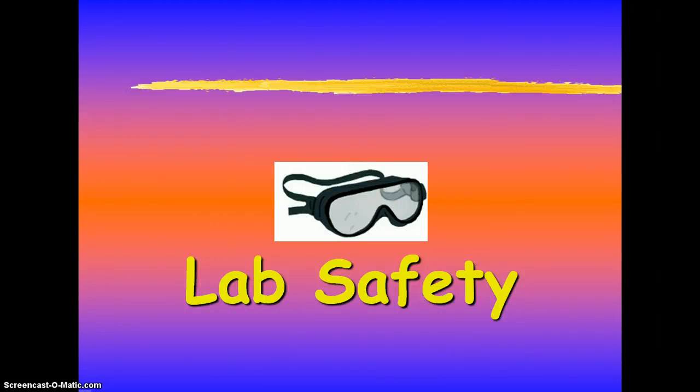Alrighty, today we are going to talk about lab safety. Hold on to your hats because this is going to be exciting.